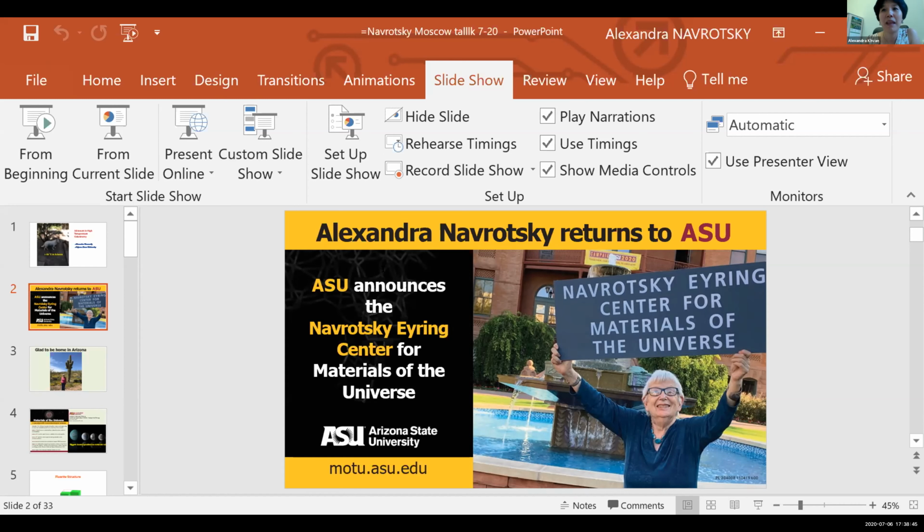Okay, thank you. Can one go even higher? I don't know. We have, of course, our sample holders and our thermocouple. The main limitation actually is thermocouple drift. We use tungsten rhenium thermocouples because, with the tungsten crucibles and so on, we have to have reducing conditions, and anyway, we're above the platinum alloy range.